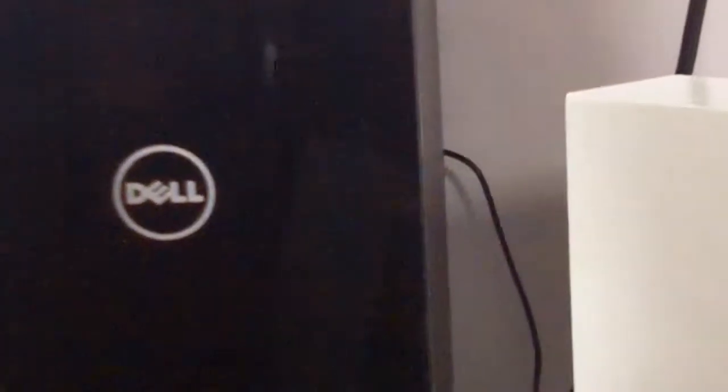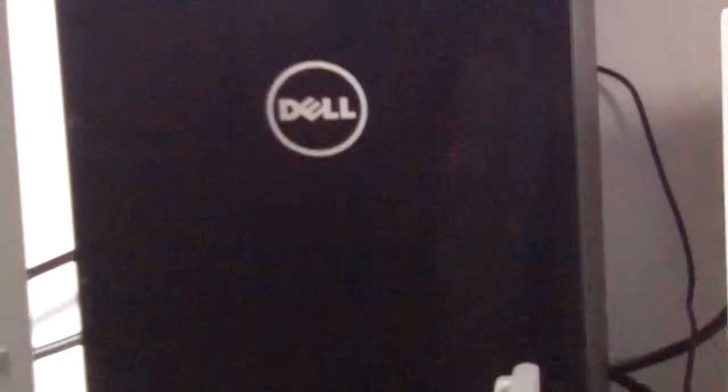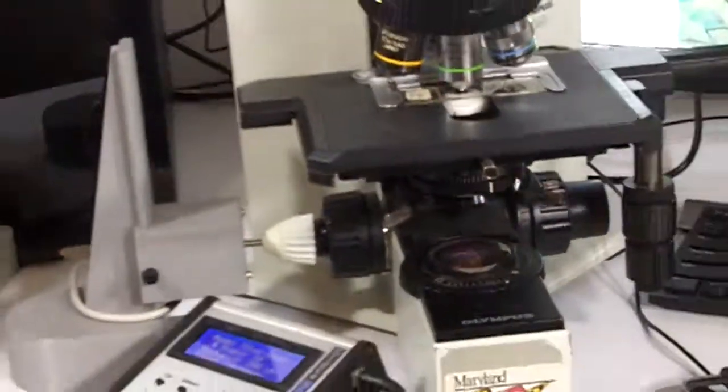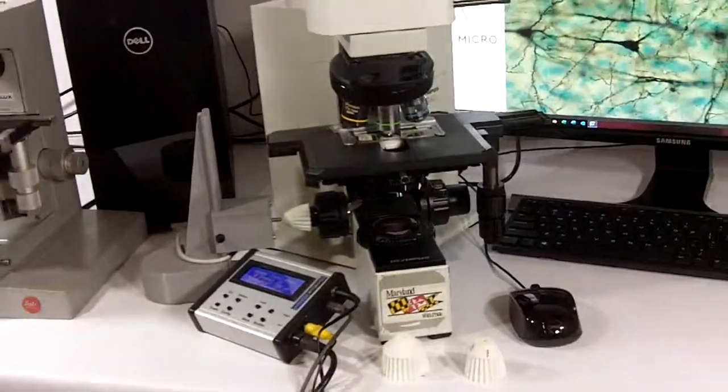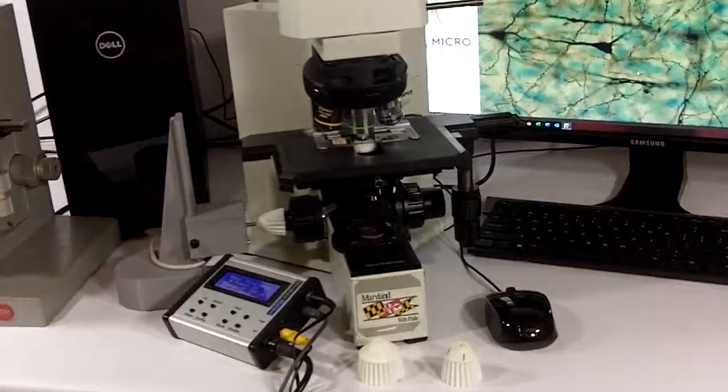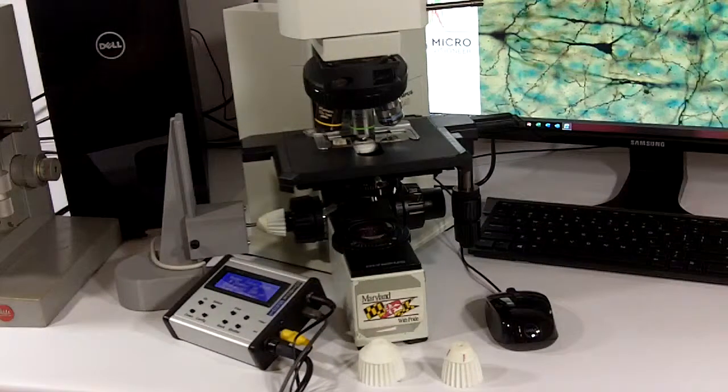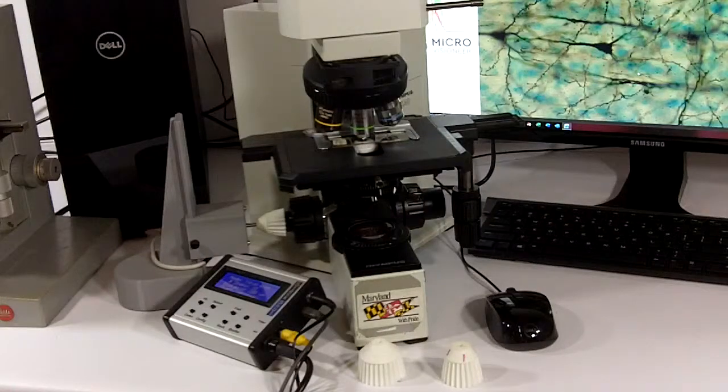So here again, here's the gripper, the pedestal, and you provide the computer, the software, and the microscope. That's our basic introduction to Retro Zed. Thank you for your attention.